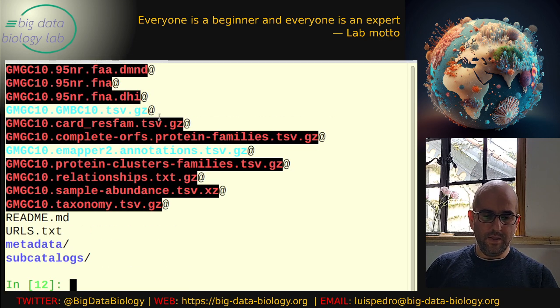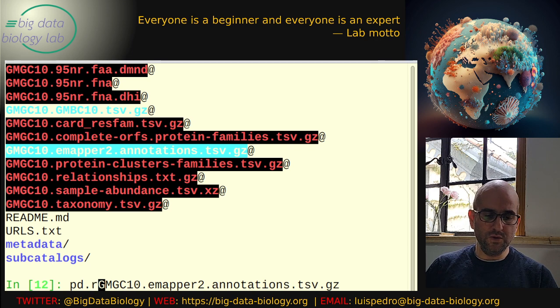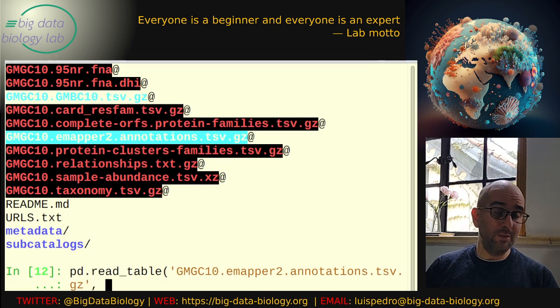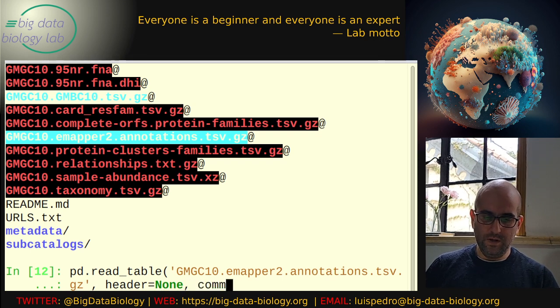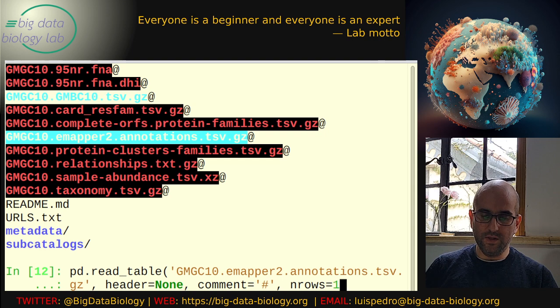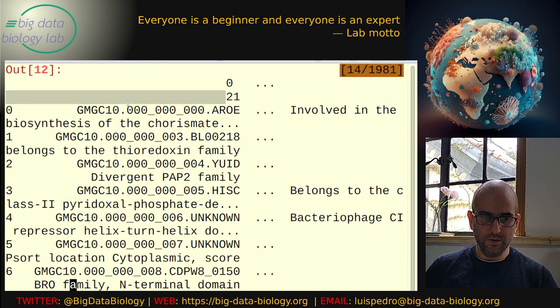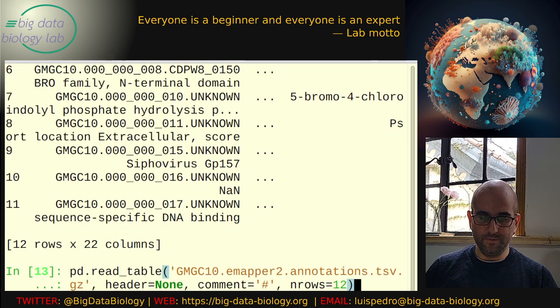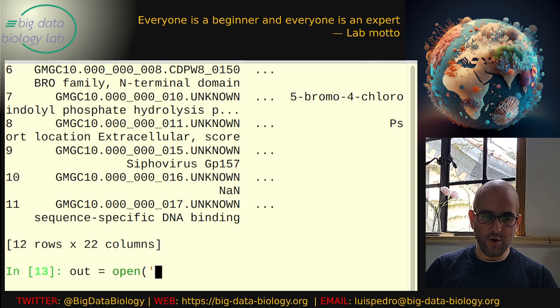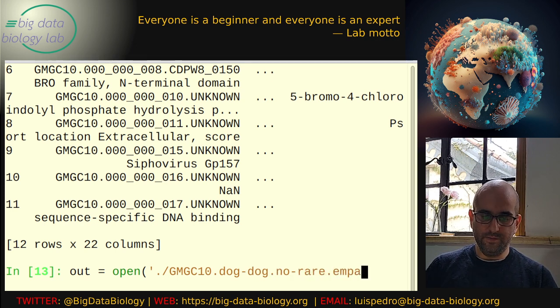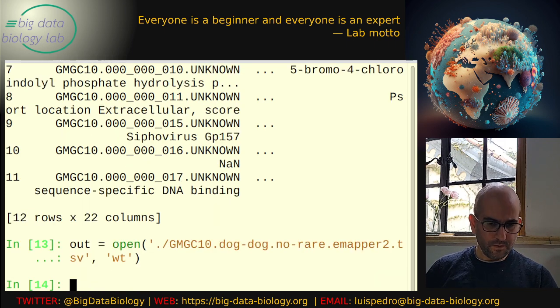I can use pandas read_table to load it, except I'm not going to be able to load all of it, so we're going to do this in chunks. First, let's check — the hash sign is a comment character I don't want, and I'm just going to load 12 rows to check. Yeah, this is pretty much what I want. So I'm going to open a new output file and call it dog_gut_no_rare_emapper.